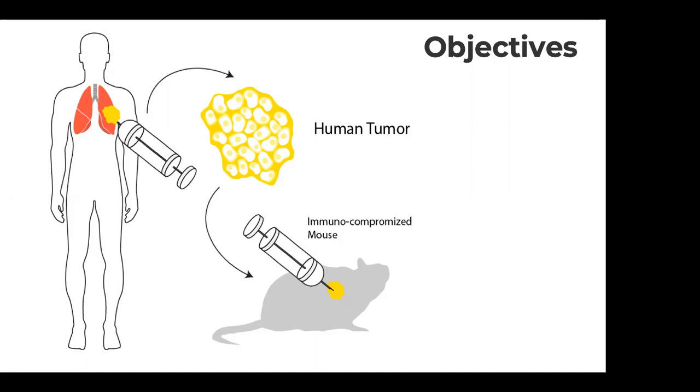In this project, we will be looking into the expressed genes and isoforms, because those mRNA will become proteins. This means we will not be looking at non-coding RNAs and isoforms, because by not taking them, this simplifies our analysis and allows us to focus on a higher level of variation.